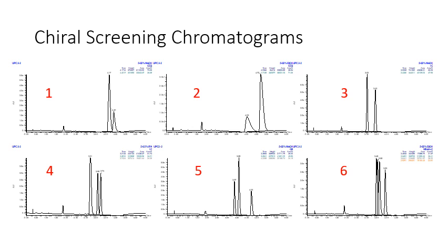These again are gradient screening chromatograms meant to show us where stationary phase interaction is. We get some complete resolution to some degree of all 4 of the peaks in chromatogram 6 here, but it's not sufficient resolution to give us high yield at preparative chromatography. So we're going to look at chromatogram 5 as our chromatographic method that we're going to scale up to prep.